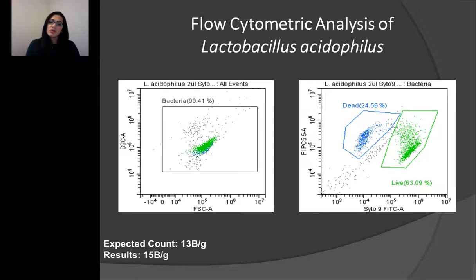Some of those samples are going to present cleaner data than others, but because of all the controls that we ran at the beginning, we have confirmed which is our bacterial population. Each sample that you are seeing here, we also plated, so we have the data to support our experiment and confirm that we were on the right track.